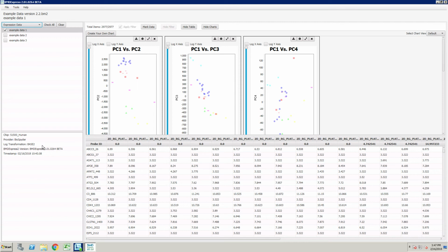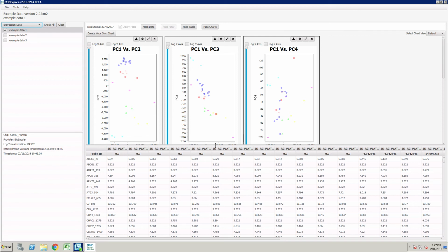And when you load this, you'll see details on the file. Right. So again, in order to get to load, you select the box there. In the expression data section for the visualizations, there are principal component analyses, and then there's the actual data.